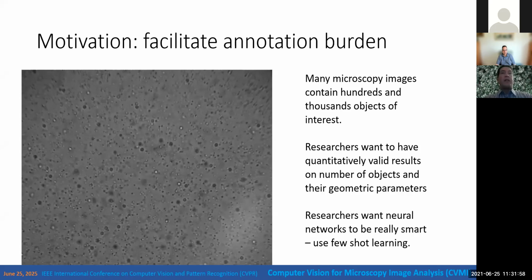We work in the field of catalysis, and for catalyst researchers, such methods as scanning tunneling microscopy, optical microscopy, scanning electron microscopy, transmission electron microscopy are very common. And for catalytic materials, it is also very common to have an appearance like you see on the slide. Typically you have several tens, hundreds, or even thousands of objects on one image. And the task is to count these objects and to find average diameter, some characteristics of shape, and so on.